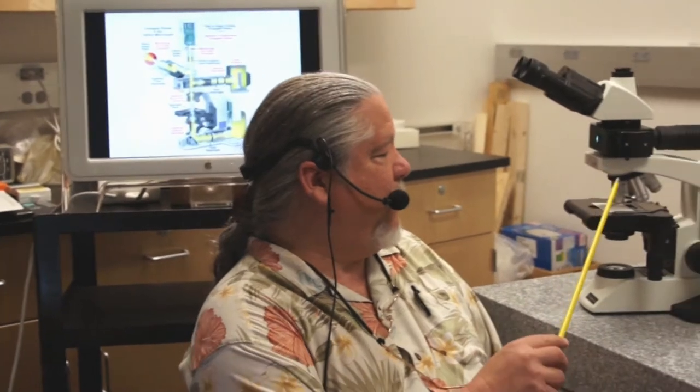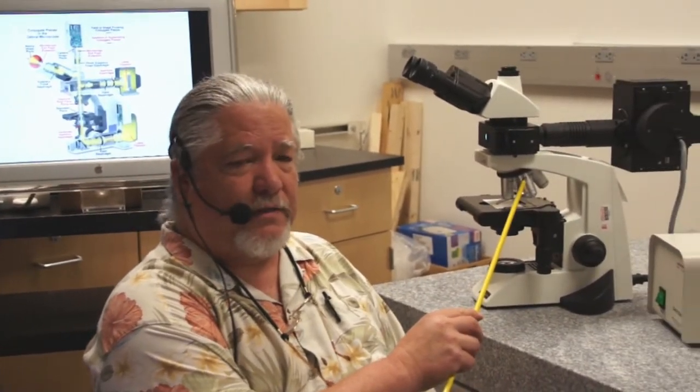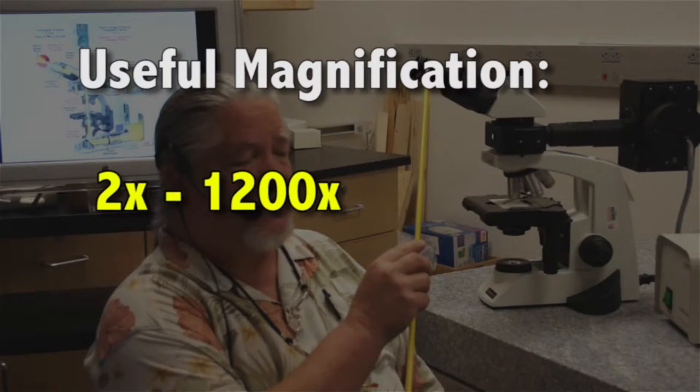This is called a compound microscope. The reason this is called a compound microscope is because to get the resultant magnification out of the instrument, you multiply the magnification of the objective lens times the magnification of the eyepiece lens. Ergo, this is a compound microscope.